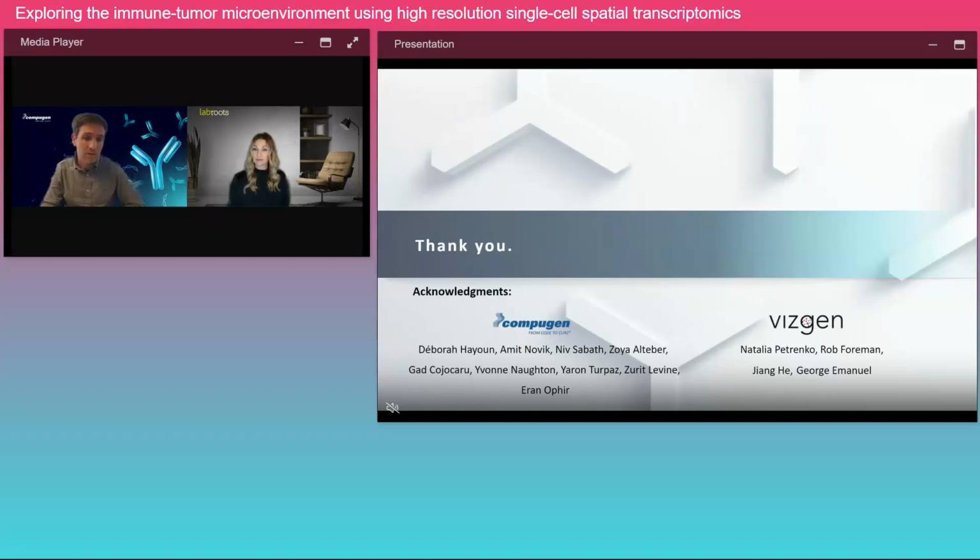We're still not final on the decision, but it seems for us that at least for now we aim to try the 1K panel from MERFISH because of all what I've mentioned before, the good cooperative work, the fact that we can gain access and really work closely with Vizgen on some custom genes that we're interested in, and really one of the main advantages also is the ability of designing a whole 1,000 gene panel.